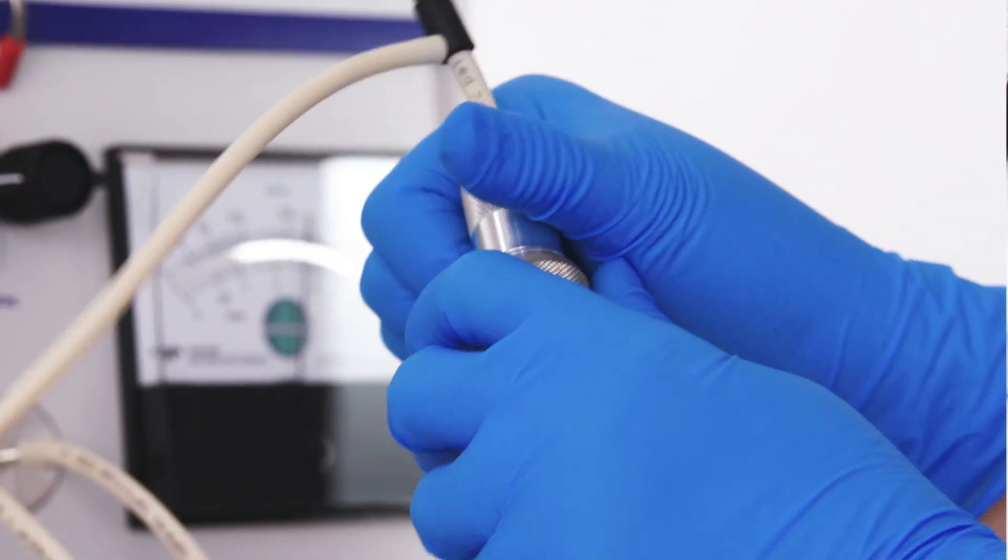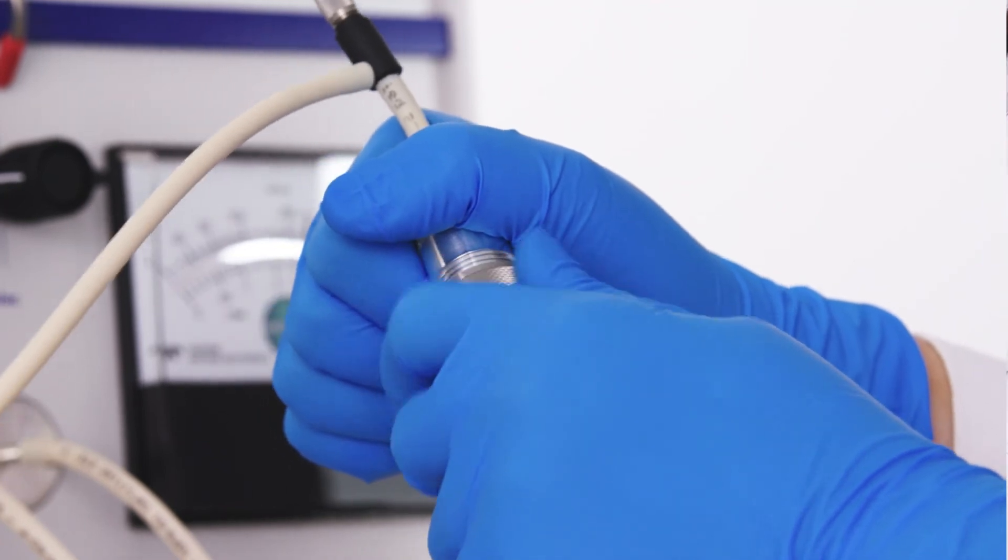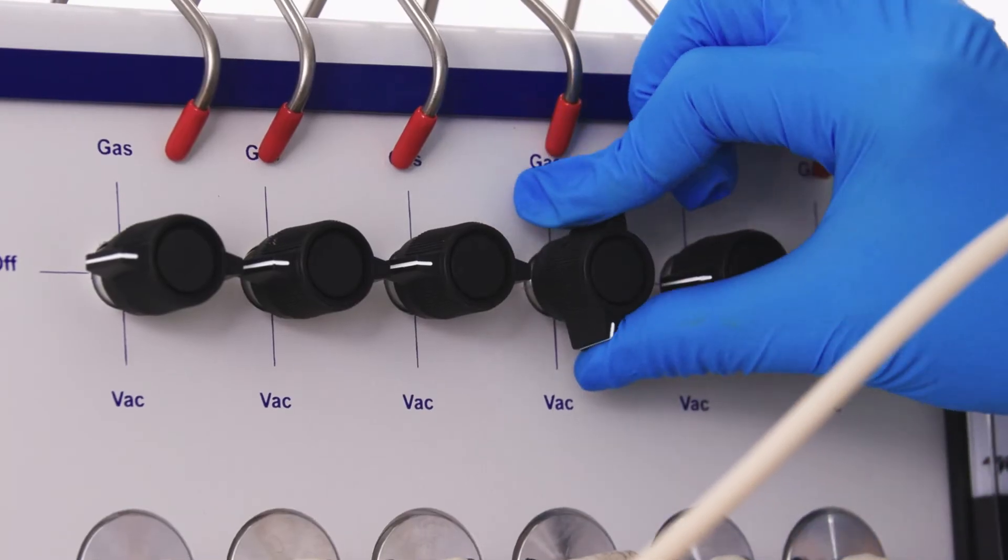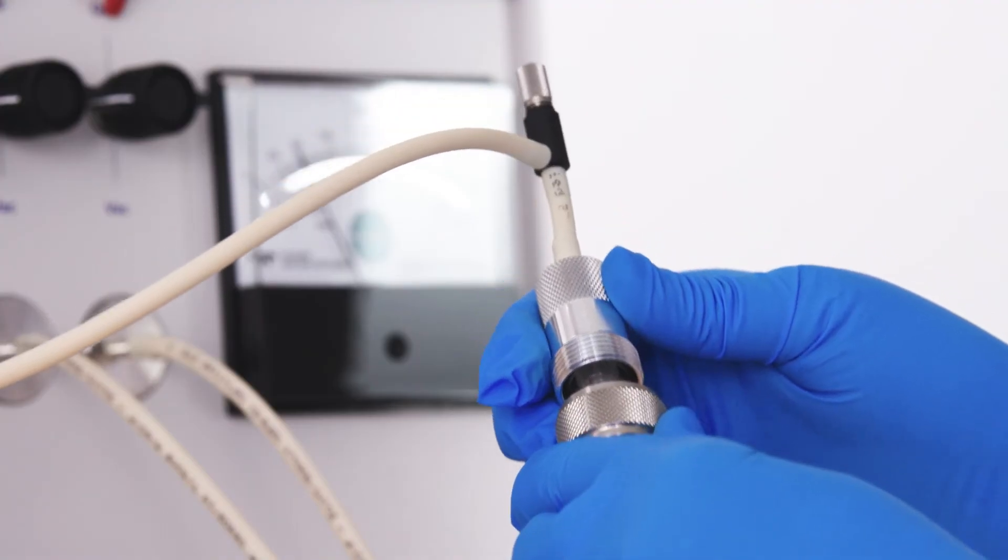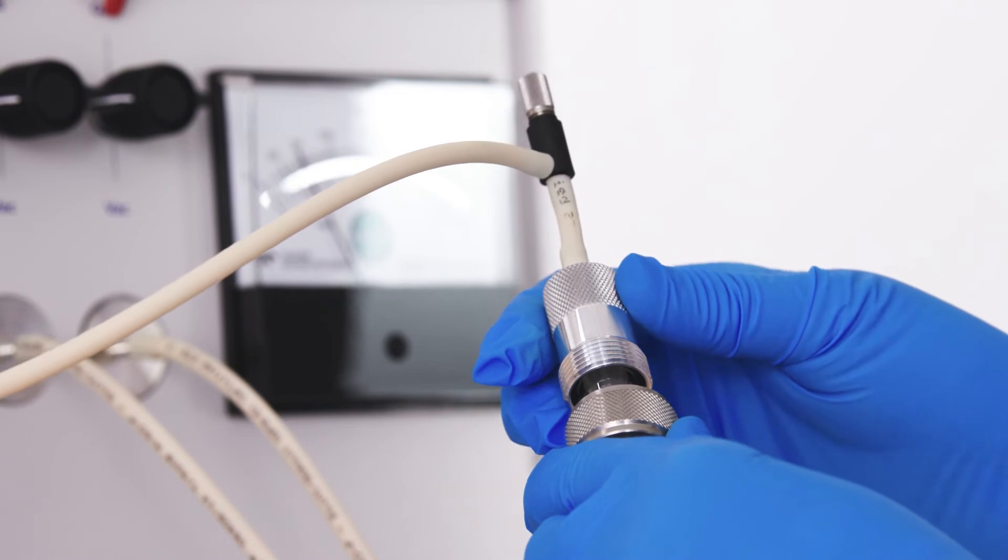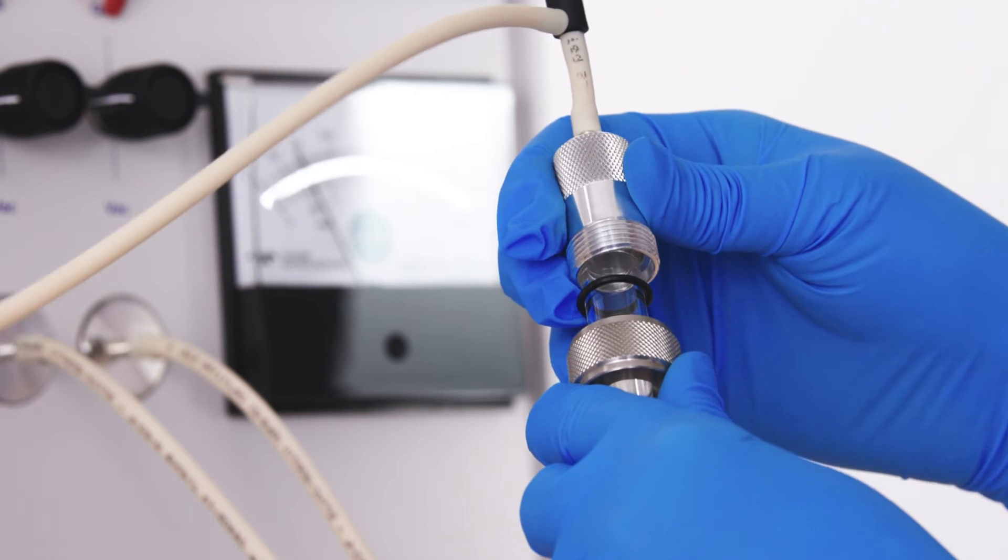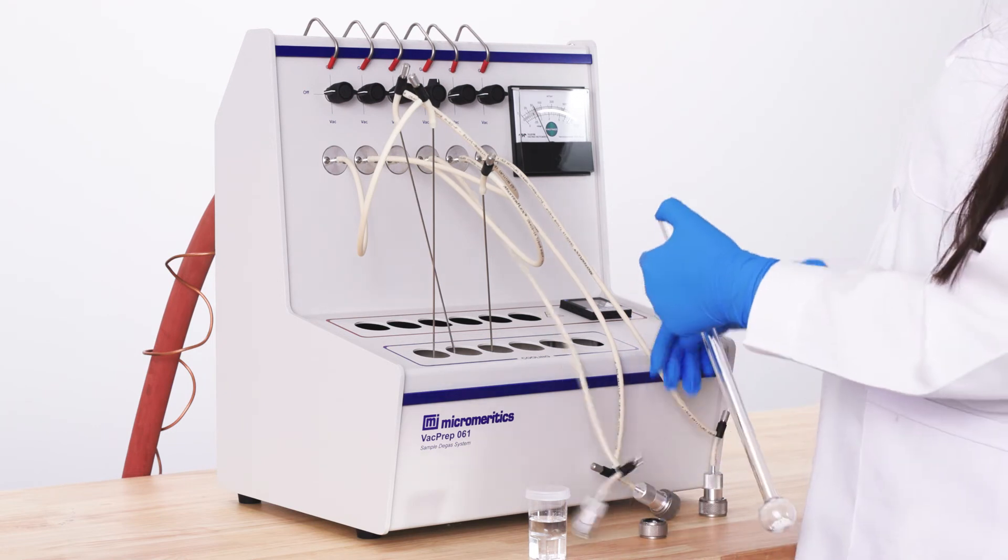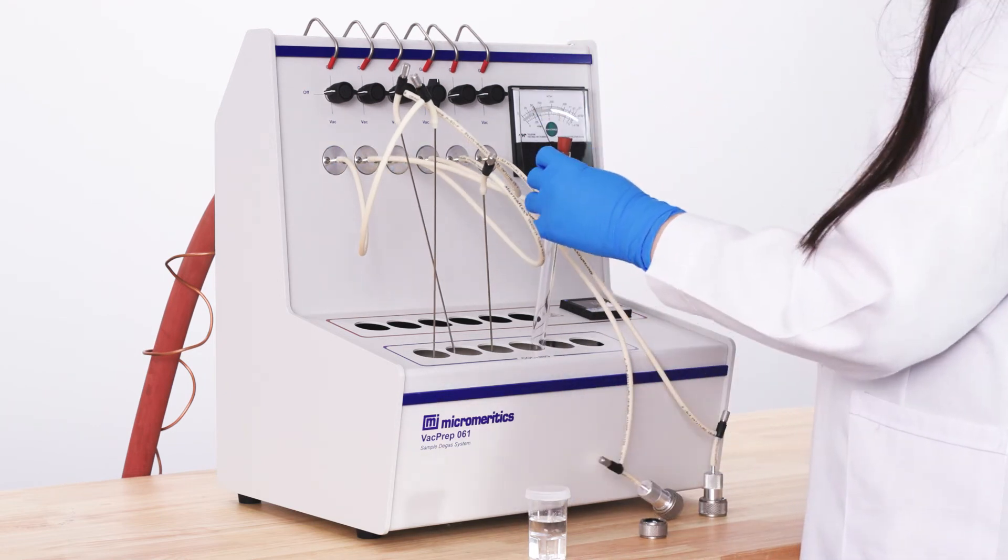To remove the sample tube mount, we recommend unscrewing the nut and then turning the knob on the instrument from vac to gas. The vacuum will be released and the assembly will pop off. Ensure to place the rubber stopper back on the sample tube. The sample is now ready to be weighed and mounted on your instrument.